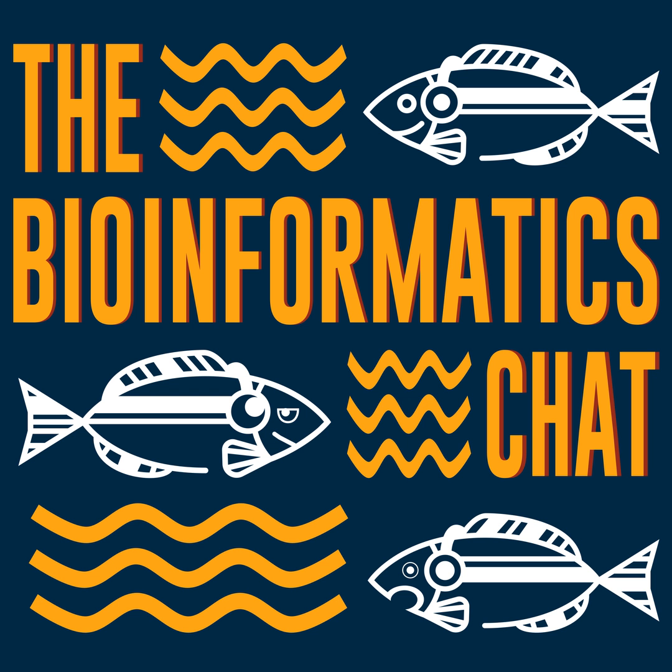Currently there exist some protocols called ultra long reads. With these protocols and with PacBio and Oxford Nanopore sequencers, you might even get reads of hundreds of thousands, and I think some labs manage to get even millions of nucleotides long reads, which is super exciting. On the other hand, the problem with these technologies is that the error rate is so much higher.